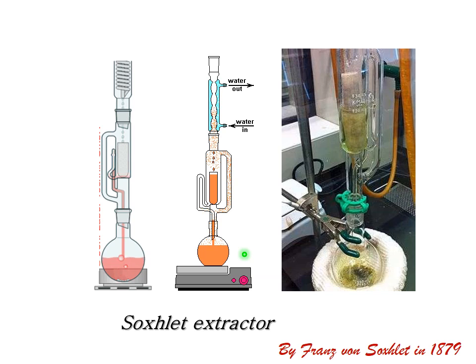So how does it work? My sample is sitting here. My solvent is boiling. It goes up and is collected at the condenser. Then it comes down onto my sample. And when it's full, it goes through this tube down to the boiling device. These are two very similar cartoon animations. So again, boiling device, coming here and emptying completely.